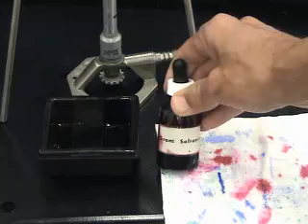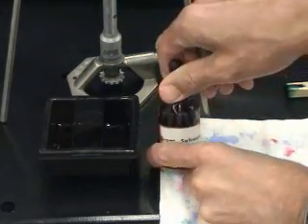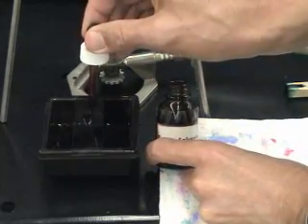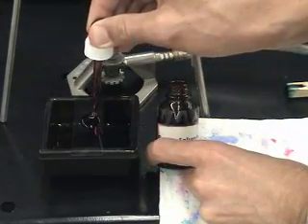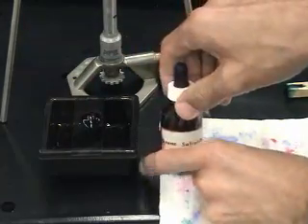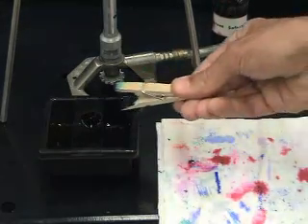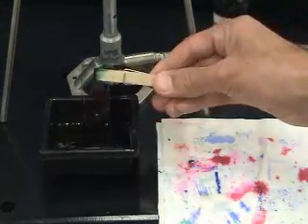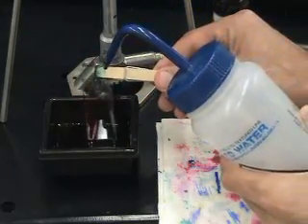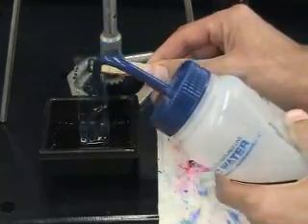Malachite green will not bind well to vegetative cells, and it is necessary to counter stain. In the protocol used here, Safranin is used as the counter stain. This staining can be done at room temperature. Finally, the slide is rinsed with water and blotted dry using a soft paper towel or blotting paper.